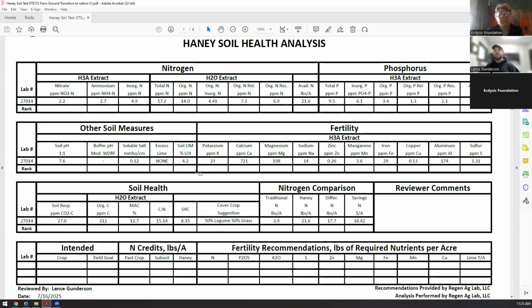Part of where that nitrogen goes is the microbes take it. They take it and they build enzymes, which are proteins, and they stick those enzymes back out into the soil. But that nitrogen, you don't measure it anymore. If you're looking for nitrate, it's no longer nitrate. If you're looking for ammonium, it's no longer ammonium. You can't find it. Microbes do that in order to access carbon and eat.